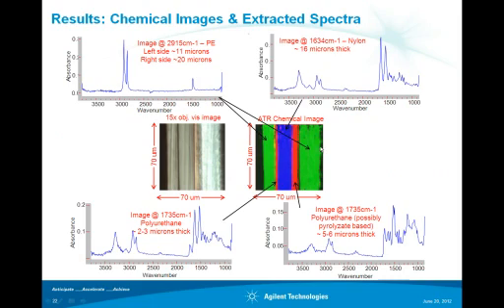On the left and right sides, identified here in green, is polyethylene. That's clear and that's relatively easy. In the middle, we have nylon, again at around 16 microns. That's relatively easy to see.